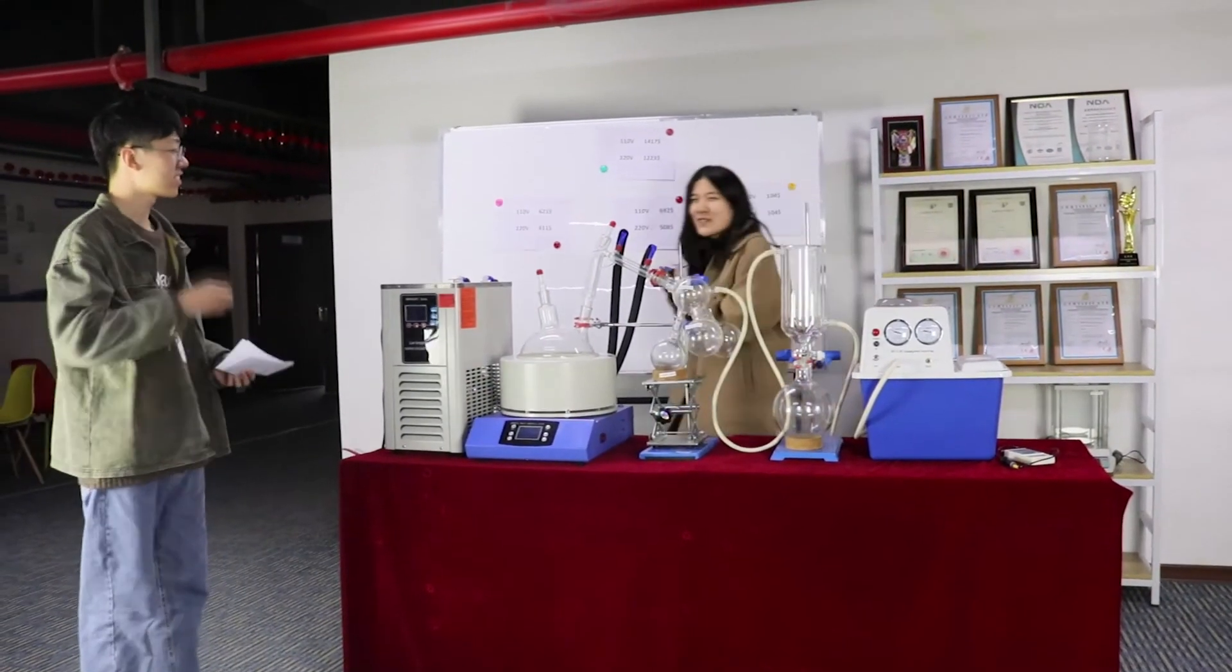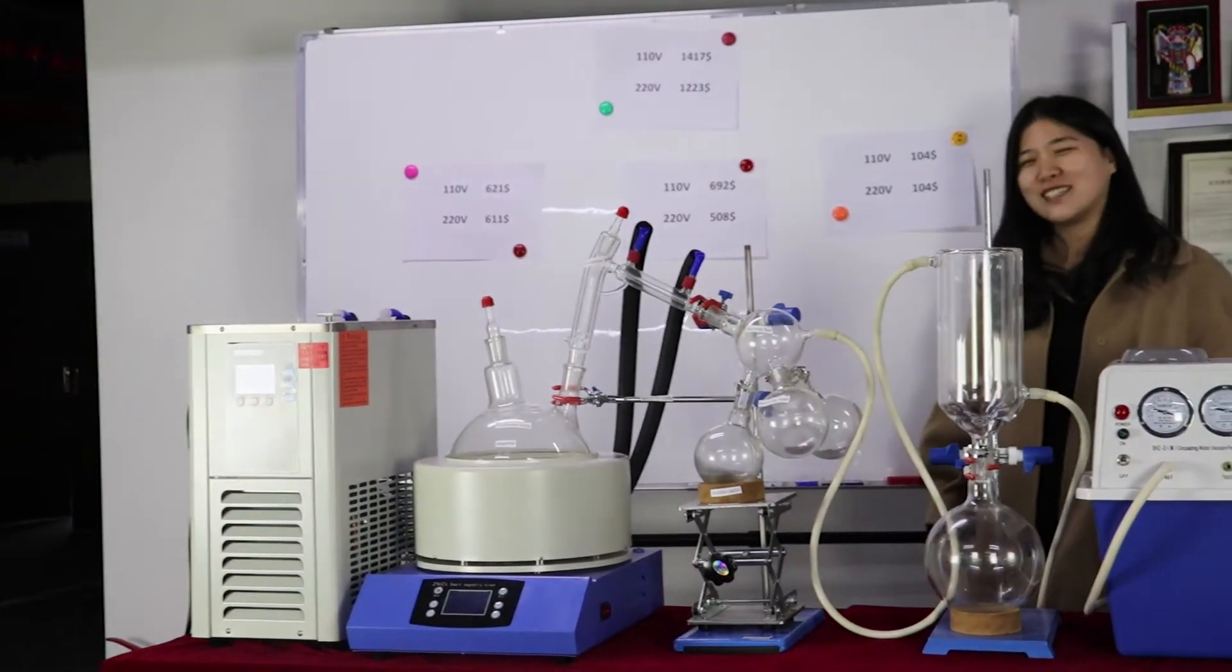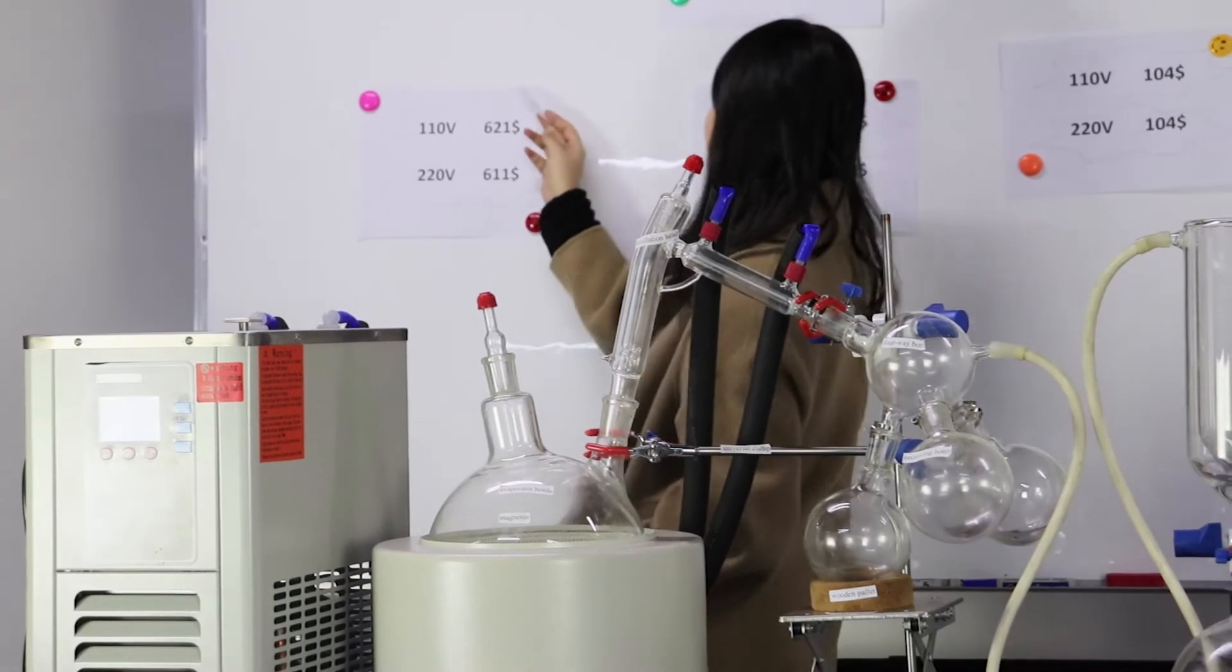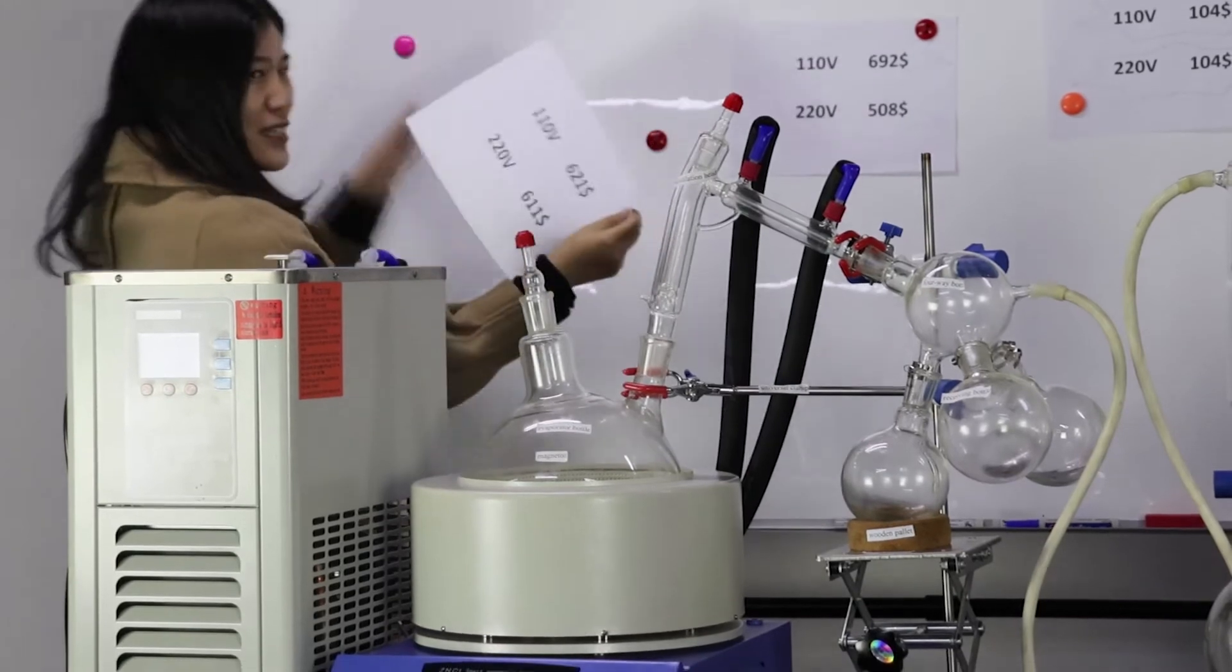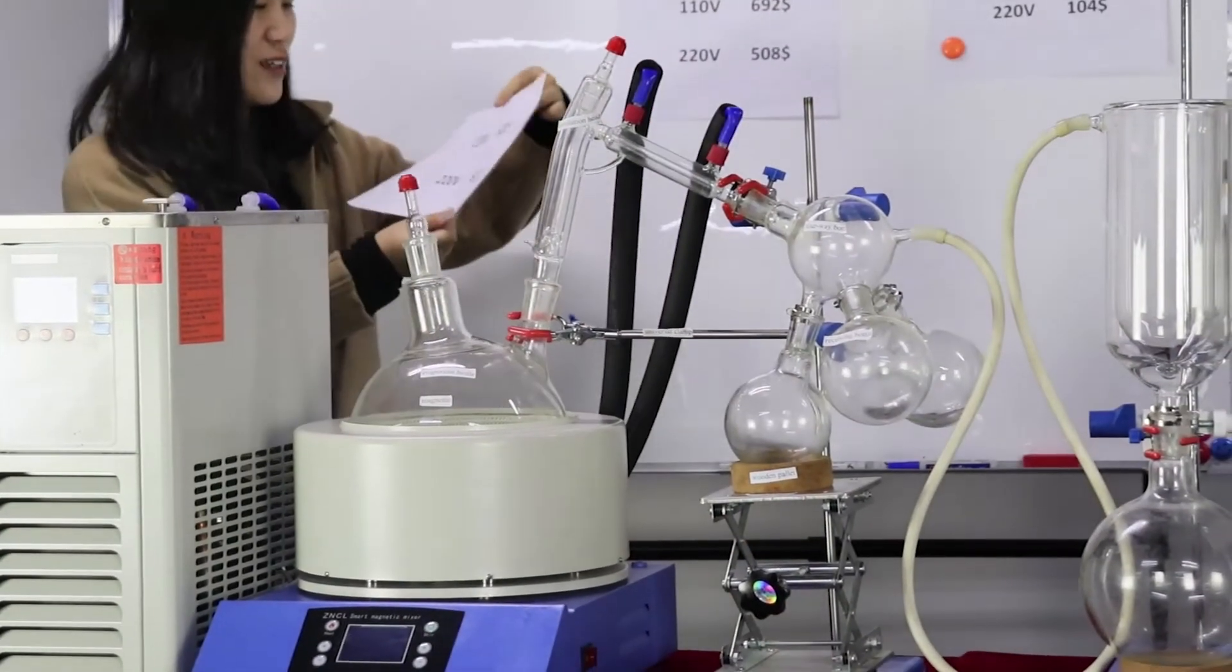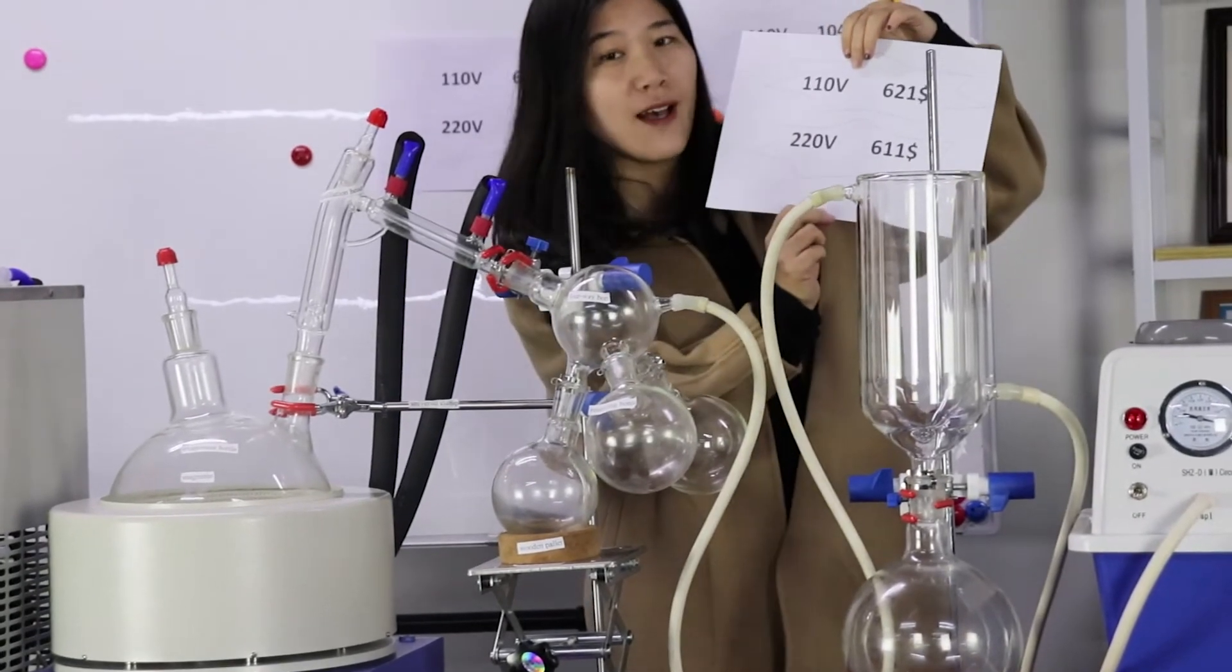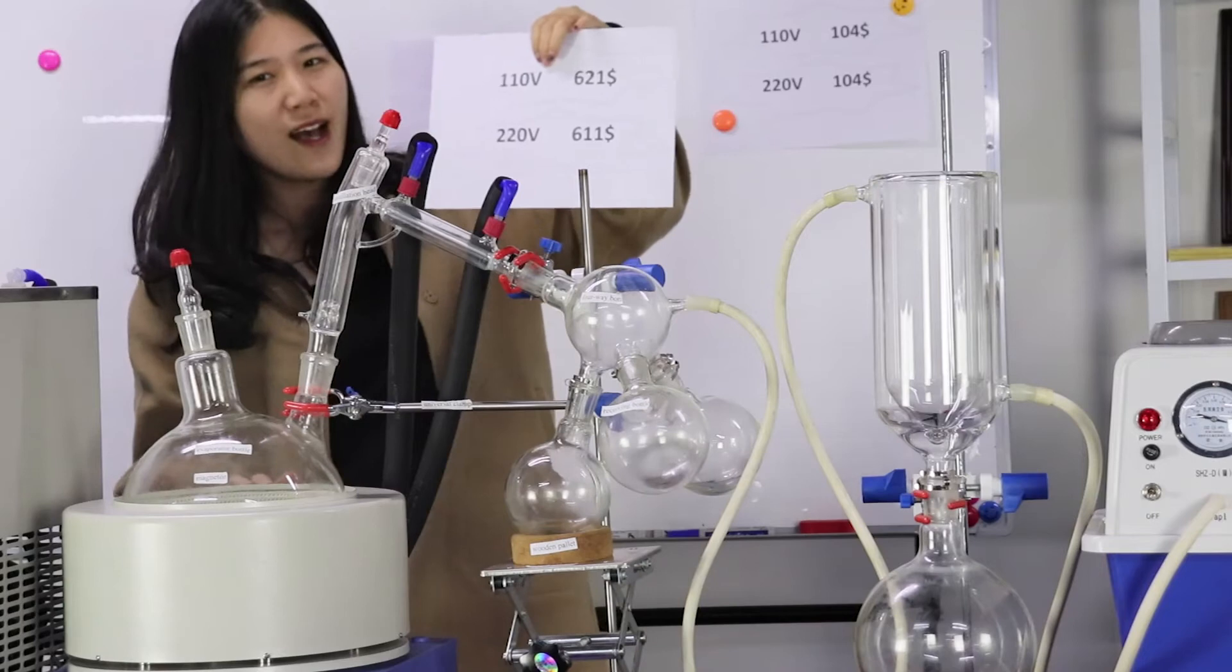Hi, I'm coming in. Now let's come to the very excited part. Yes, excited, because of the price. The price is very exciting. This is clear. Yes, the distillation system today just needs $1,611. Yes, $1,611.